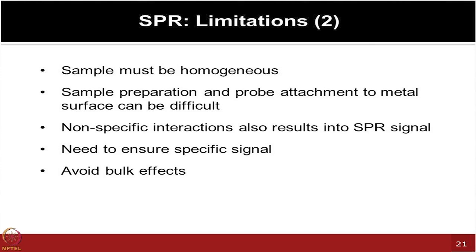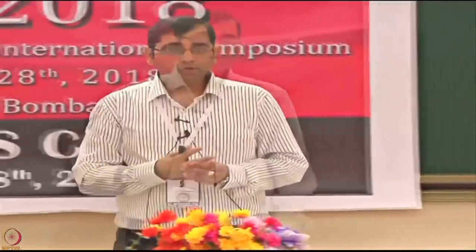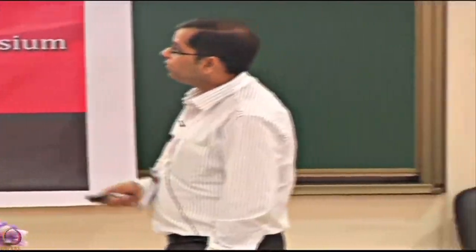Of course, many of these things in the field of label-free technologies, you have to ensure that the binding you are seeing is actually real binding. It's not artifacts. Sometimes you will see a reaction happening in a temperature-dependent manner, so you also have to play with those. Fortunately, some of these instruments and technologies now give you a range from 4 degrees, and you can vary up to 37 to 50 degrees even, to try different conditions.